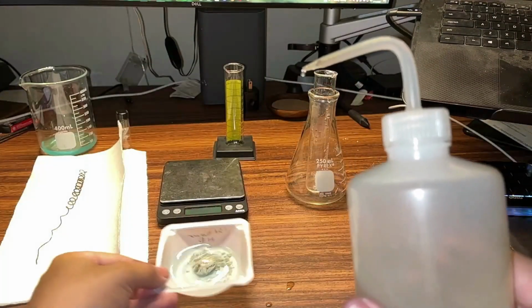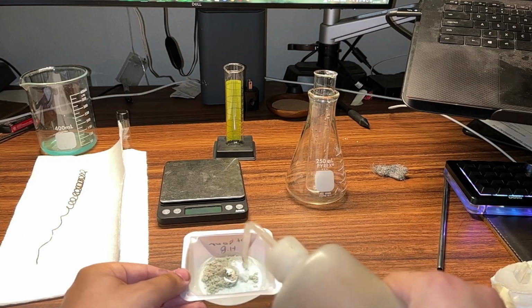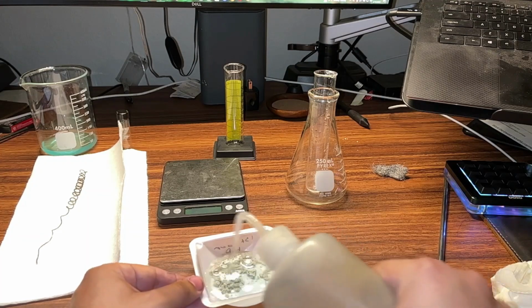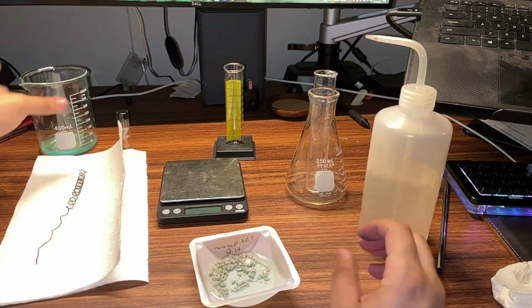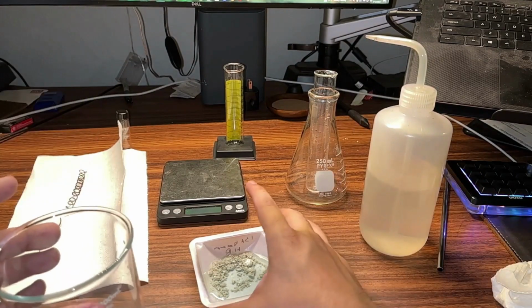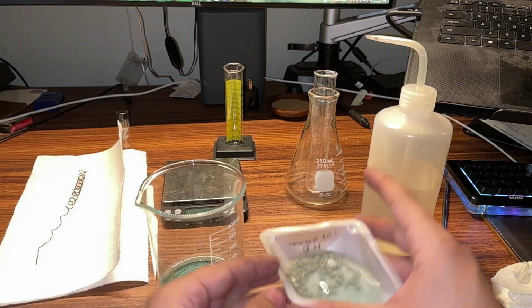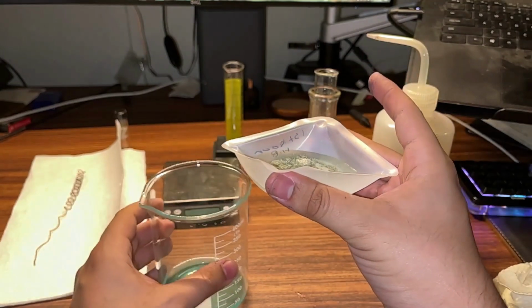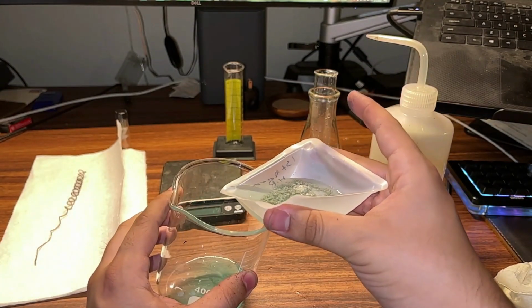I'm almost done, but I'm not quite, because like I said, I want silver in my weigh boat, and right now I have silver and water and copper ions and nitrate ions. I don't want all that. I just want the silver. So I poured some more water in there. This is called washing your product. I just sprayed some water, and now I'm going to decant again.